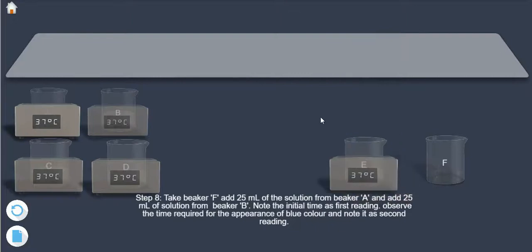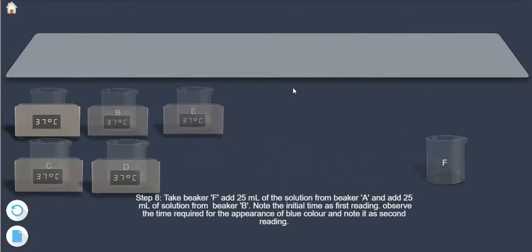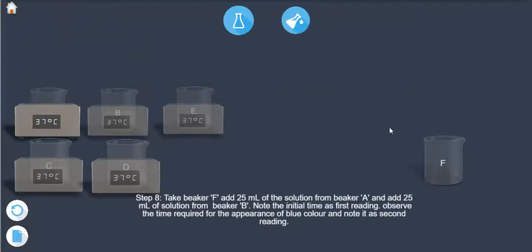Step 8: Take beaker F, add 25 ml of solution from beaker A and add 25 ml of solution from beaker B.